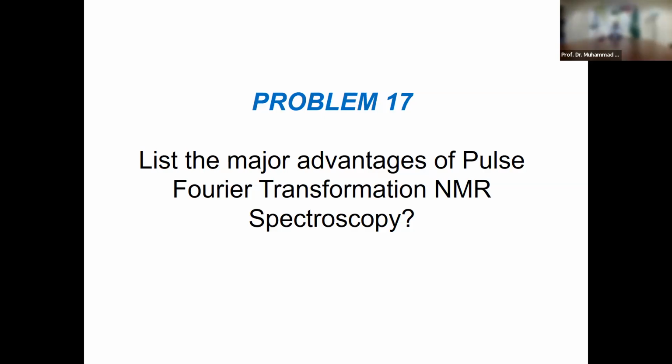but that is just obsolete, gone. This is past, because it doesn't explain modern NMR spectroscopy. In order to understand modern NMR spectroscopy technique, you must understand pulses, you must understand vector diagrams, you must understand FID and Fourier transformation.